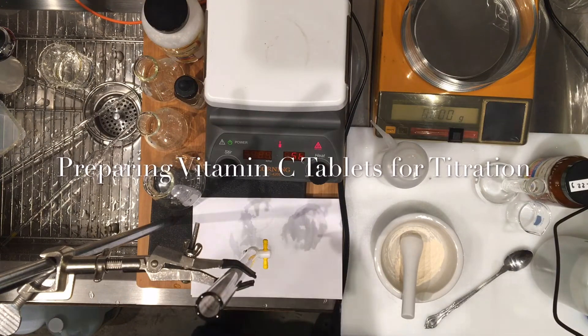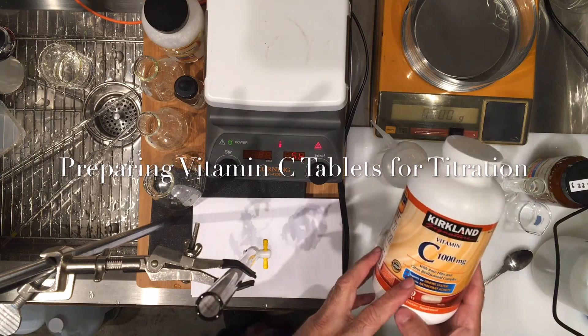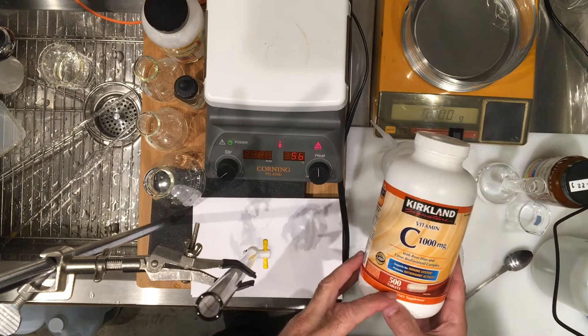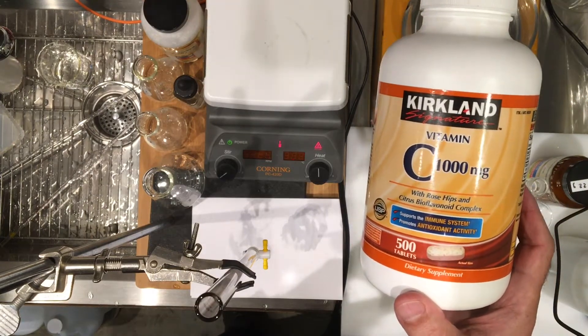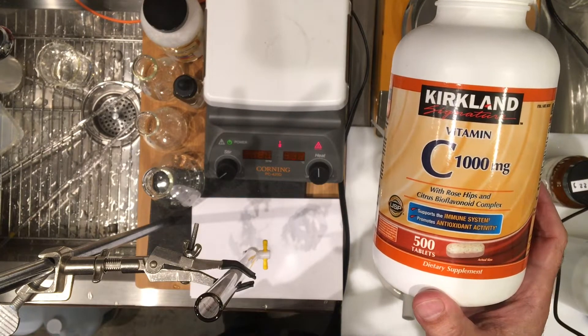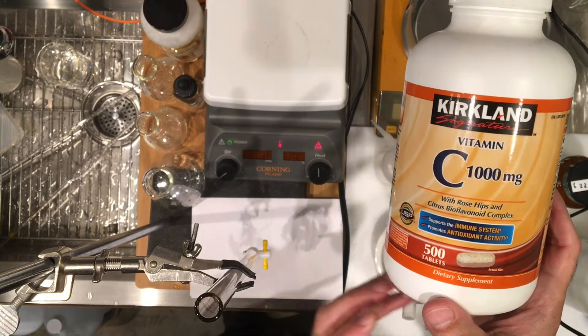Now we're ready to do a titration for determination of the milligrams of ascorbic acid in vitamin C. I'm holding a vitamin C container labeled to have 1000 milligrams of vitamin C. Vitamin C is ascorbic acid, and the tablet itself contains other fillers.